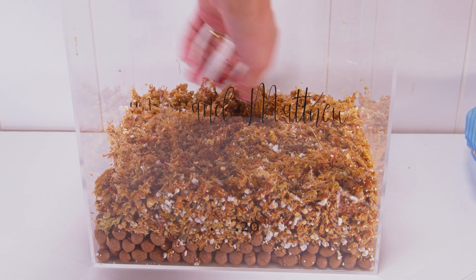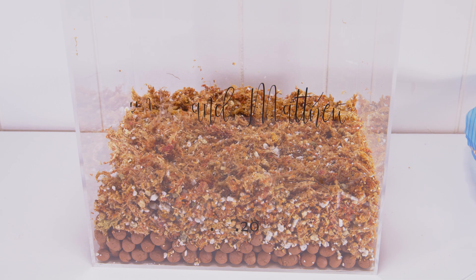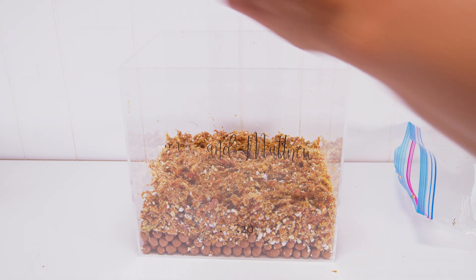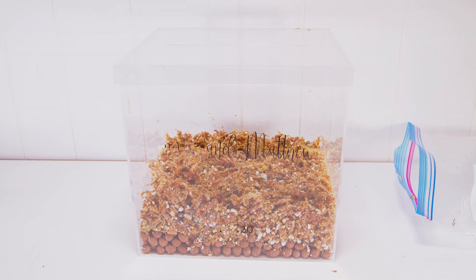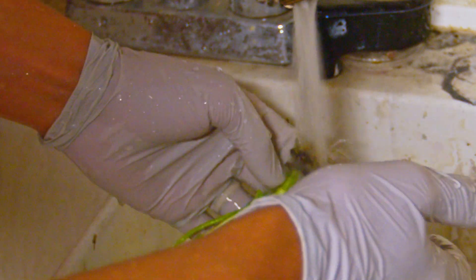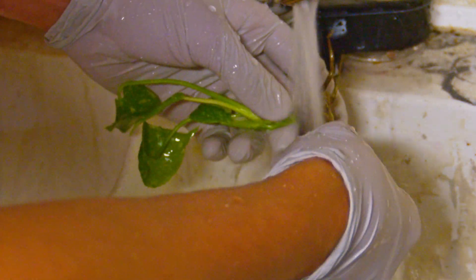Once you have your tissue culture clones ready, be vigorous. Use a toothbrush, use anything to get that agar off. All the sanitization is, in my opinion, a lot less important than getting that agar off. If there's no food for stuff to grow on, it's going to be just fine.